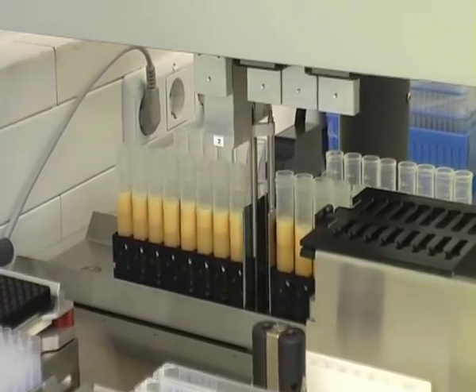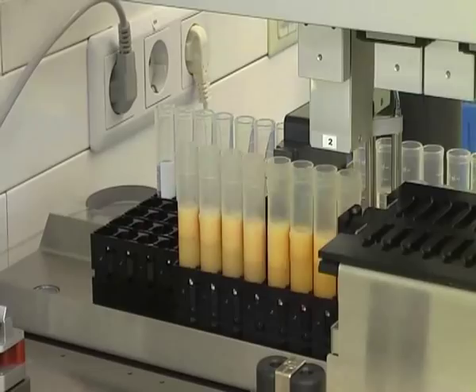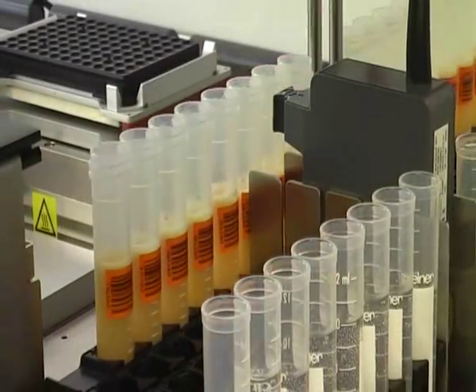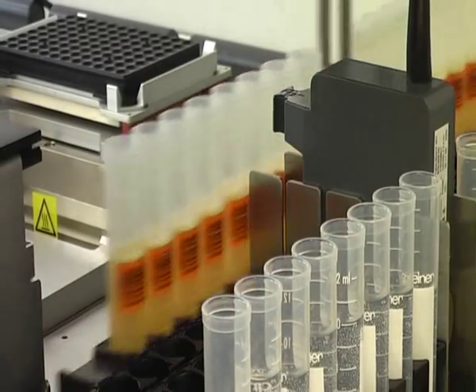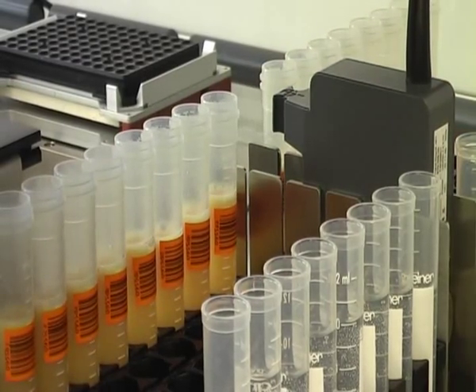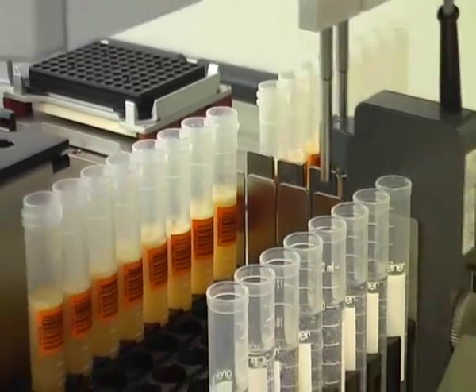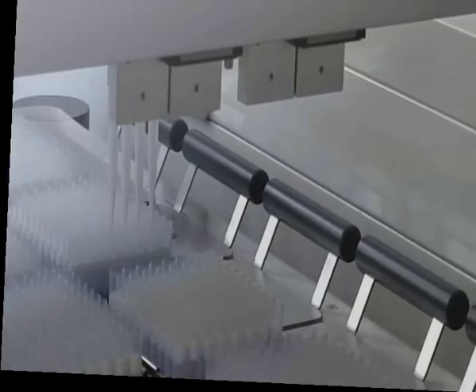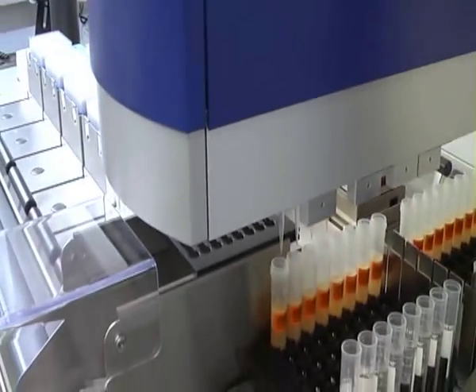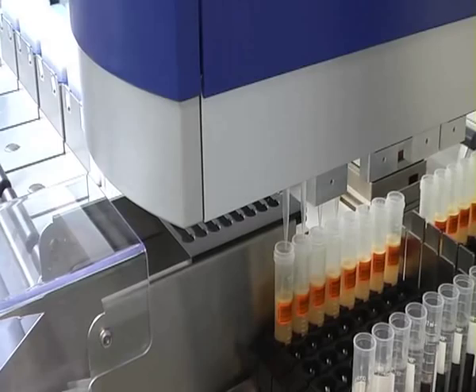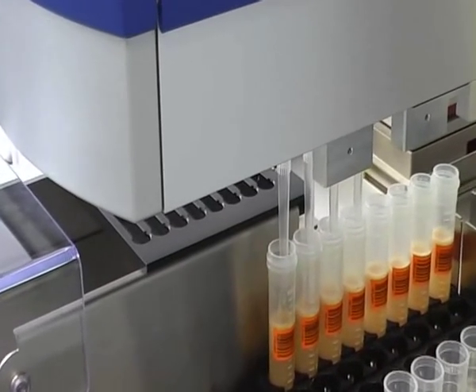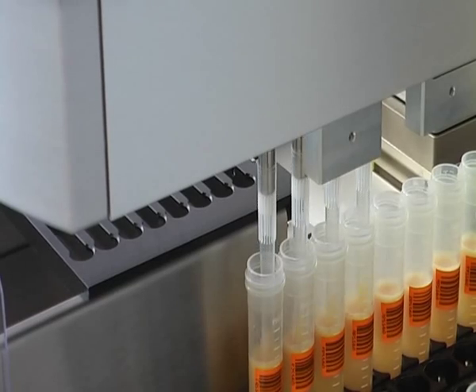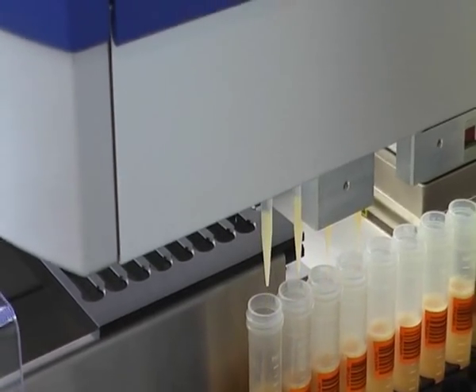In the first step, the barcodes of the sample tubes are read, enabling the software to automatically identify each sample throughout the entire process. After the gripper transfers the process plate to the work position, 200 microliters of enrichment are transferred from the sample tubes into the process plate.